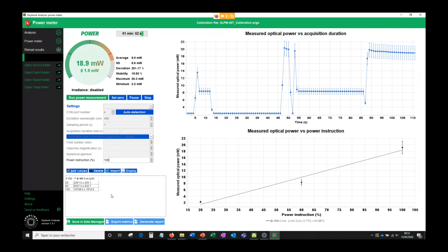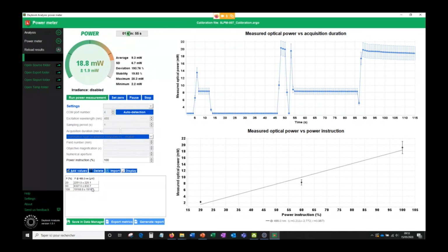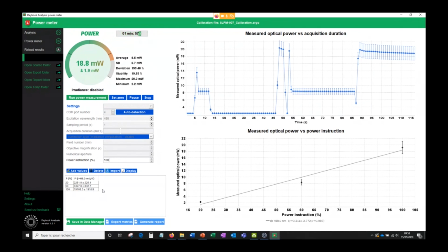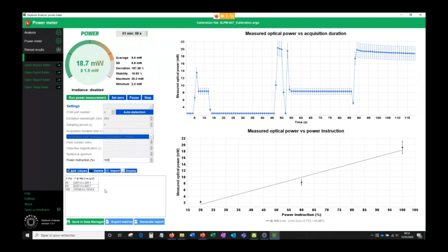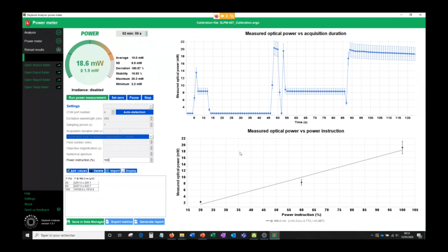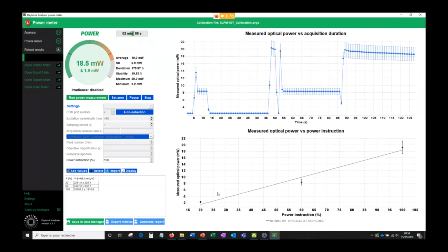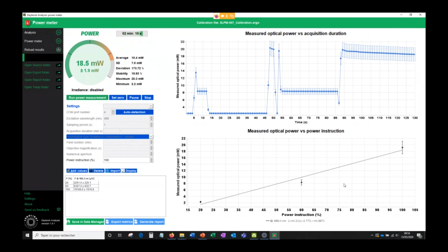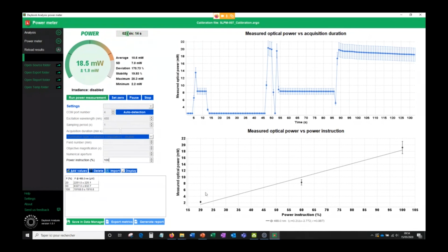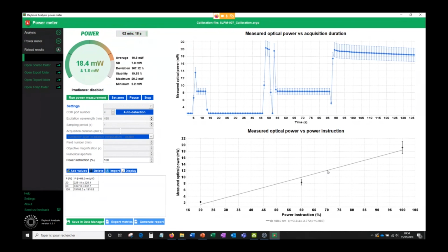So first of all, I have a power measurement on my power instruction. So I can go back to the user and tell him what are the different powers of the light source of the microscope. And secondly, if you are in your QC process, you can see that the instructions are not linear because there is apparently something that goes out of the tolerance.